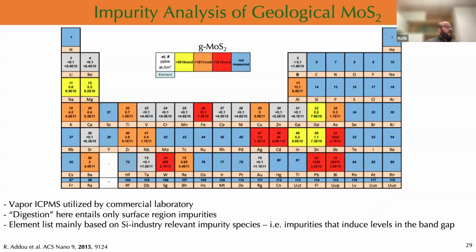In the STM images we see a lot of local variation, but we believe it's due to the presence of impurities. But when we do XPS, we cannot find any impurities. And we know that the detection limit of XPS is one per thousand, or 0.1 atomic percent. So for that, we need a technique that can detect impurities below this value.